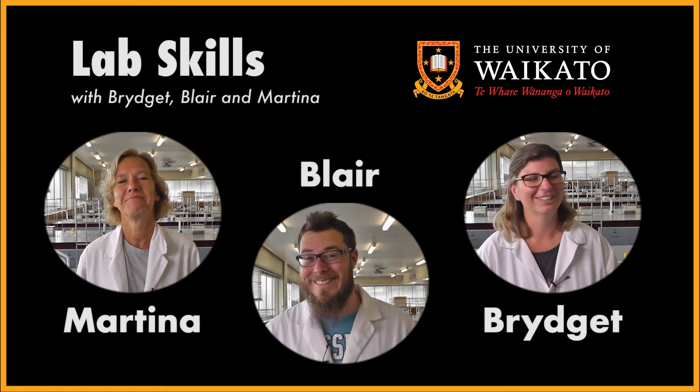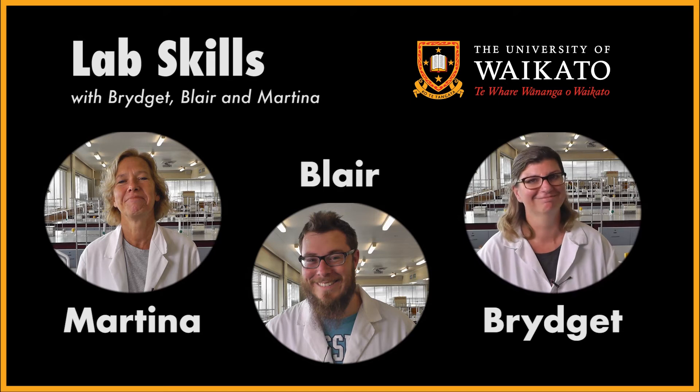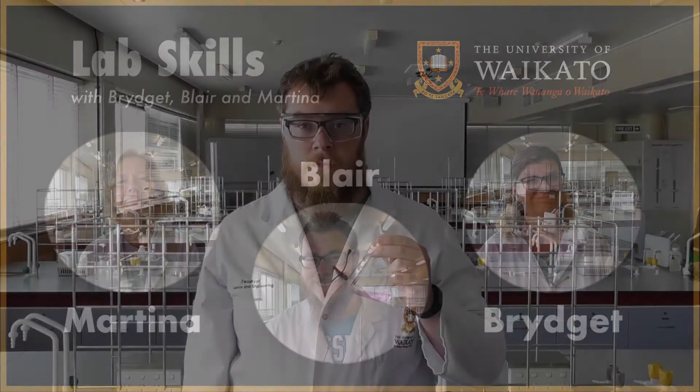Martina Blair Bridget. In this video, we're going to show you how to carry out a titration.